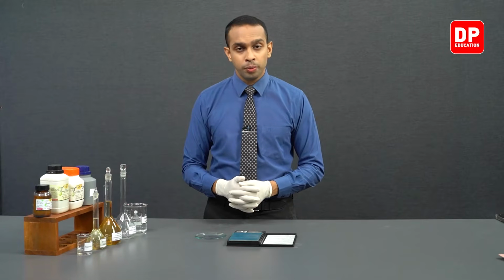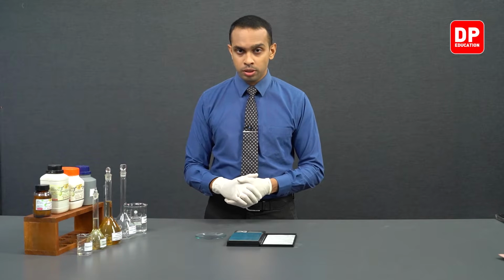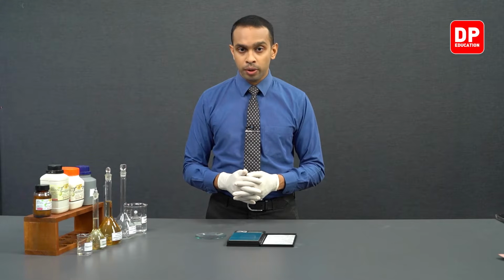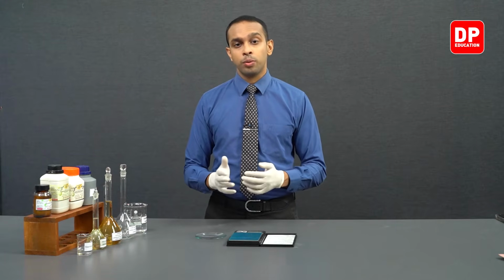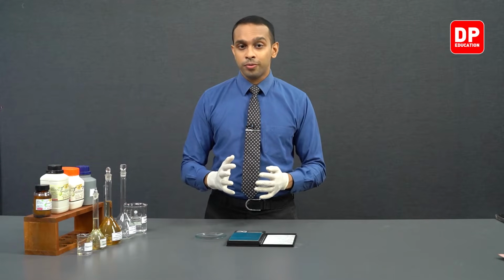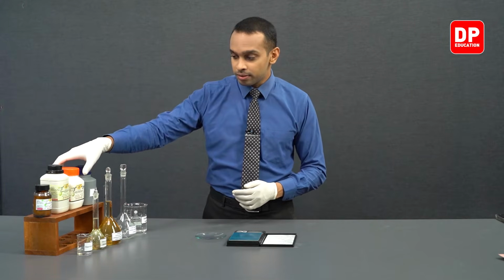Now we move on to preparing another solution, which is sodium thiosulfate solution. The concentration of the solution we are going to prepare is 0.06 moles per decimeter cubed. So for this experiment, we need a sodium thiosulfate solution of 0.06 moles per decimeter cubed, and the molar mass of sodium thiosulfate pentahydrate, which we have over here.